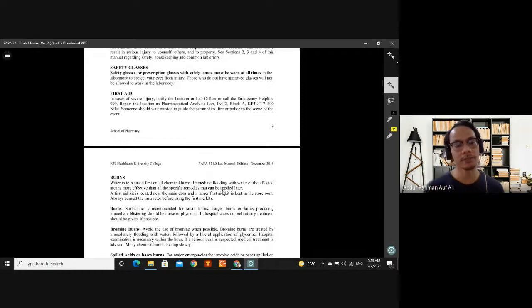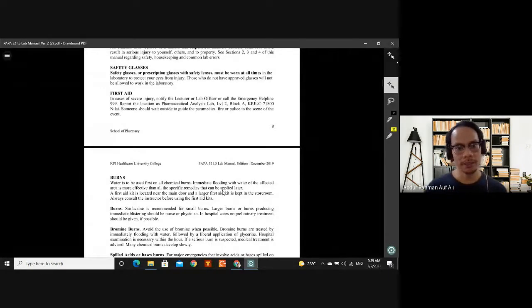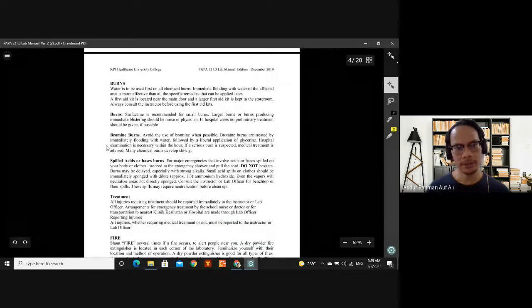Okay, if any chemicals go into your eye and you feel hot, itchy, or stinging, you just go to that machine, step on the place where you can release the treatment water. It's treated with, what do you call it, a diluted something that will soften the burns. So treat with that first, and then after a while, if it still stings, get in contact with the hospital. Okay.